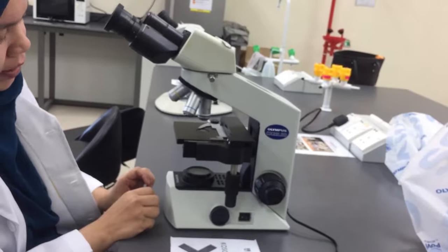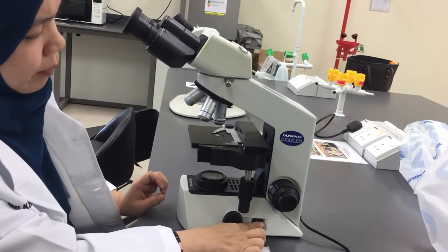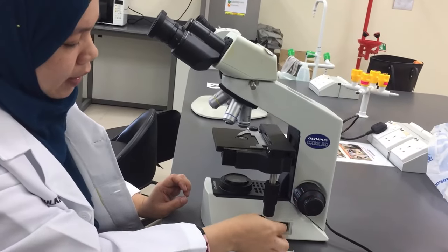When you want to use the microscope, you need to switch on the light source. Because it is known as a light compound microscope, it uses a light source, and it is connected to the electricity via a plug.